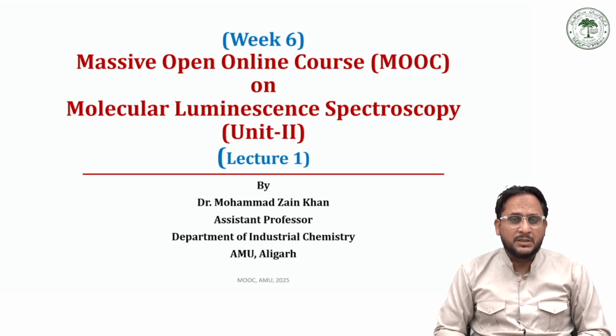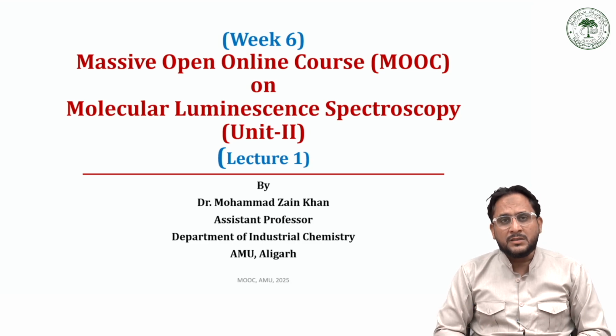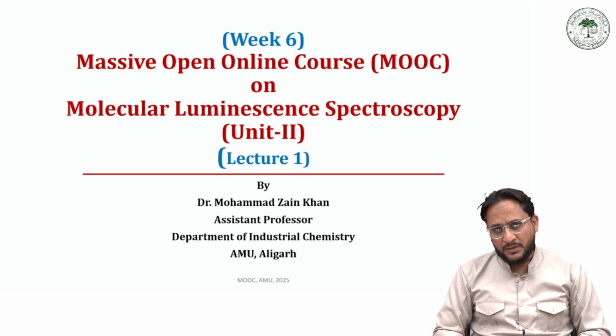Out of these components, we have completed the light source, and there are three types of light sources. The mercury lamp, but because of its lower intensity, it is not much prevalent these days. Then we have xenon lamps, which are further divided into two categories: the xenon arc lamp that provides a continuous bright light, while the xenon flash lamp provides a very high intensity bright light, but for a very short period.